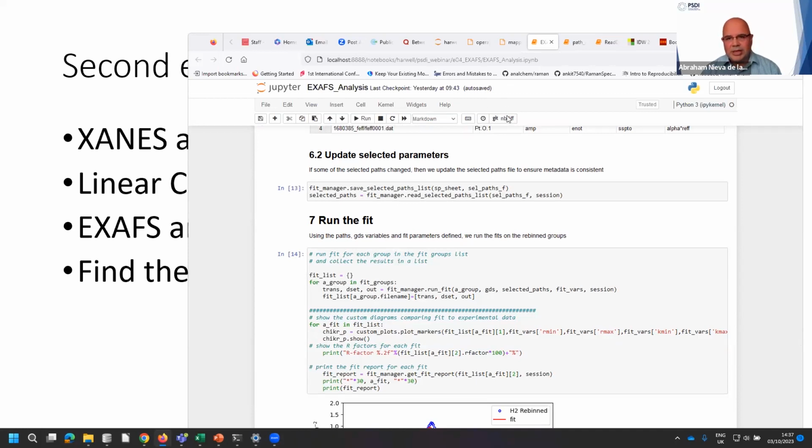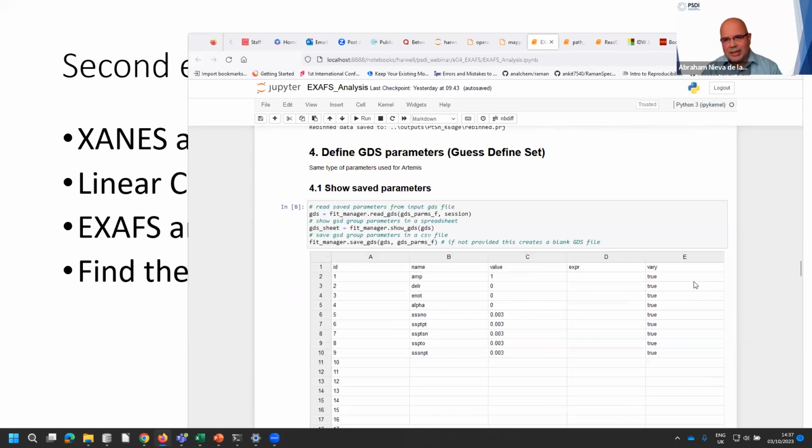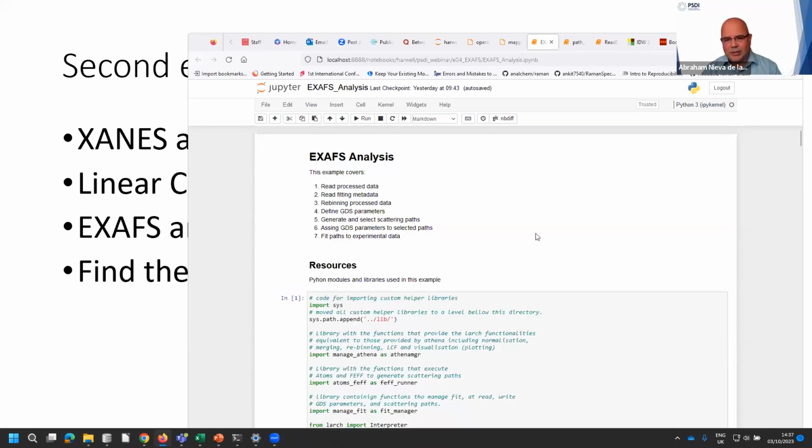one-click reproducibility. So the thing is, if I clear the notebook, or I restart the kernel that clears all the outputs and restarts, and then I just click on run everything, which is this button with the double forward arrow, then the notebook runs automatically and produces the same results consistently.